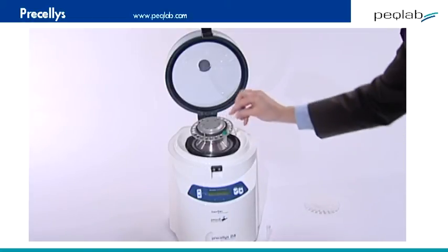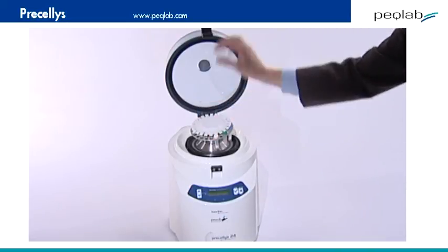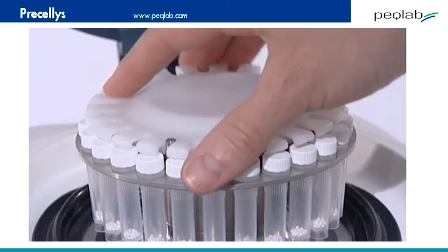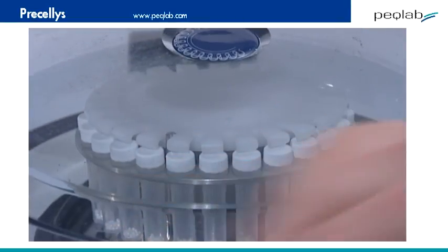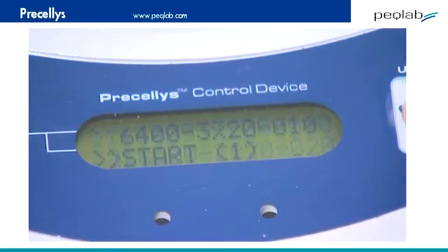It takes up to 24 tubes, but you can put in just 1 or all 24 — they don't need to be balanced. The press-on lid plate is held tight by a vacuum, which also operates to confirm that the system will run safely, so the lid requires no screwing down or the use of tools, which occurs in other systems. Then close the lid again; the safety sensor contact is established, then press go.